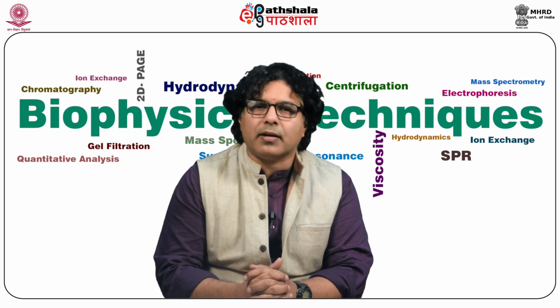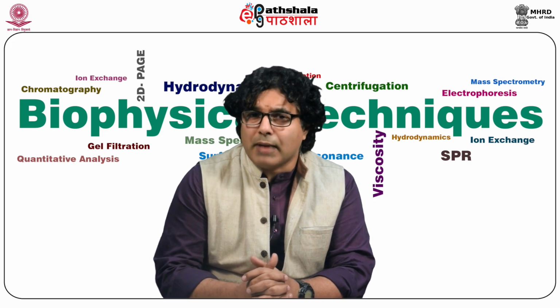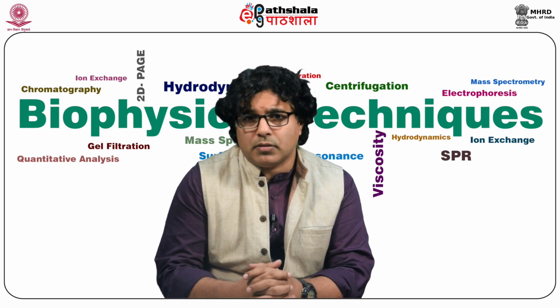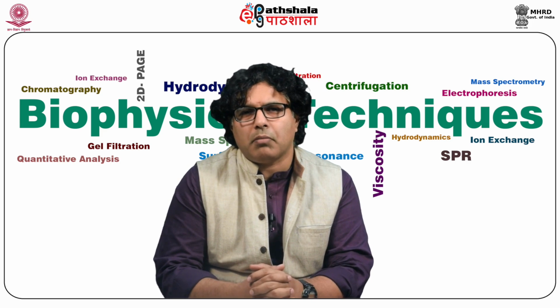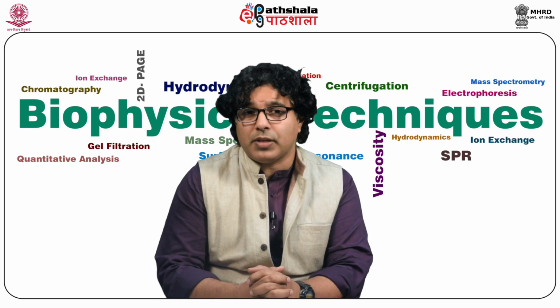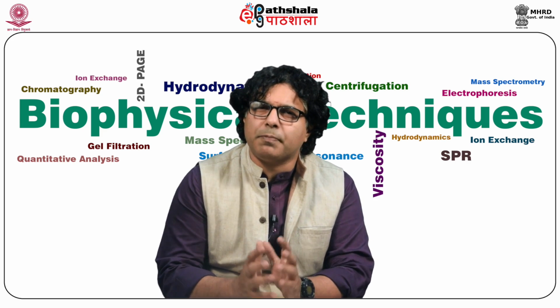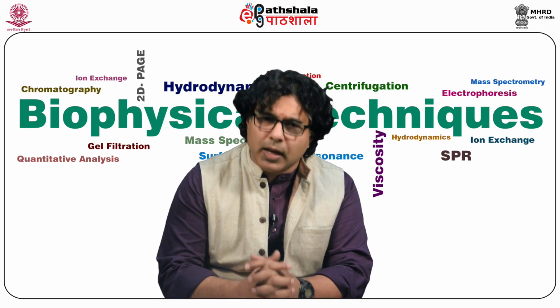For example, you take blood. Blood is one of the dirtiest matrices you could think of. The blood contains RBCs, it contains plasma. Plasma contains much albumin. Now you see the complication: you have so much lipids, so much protein, and so many other interfering elements.